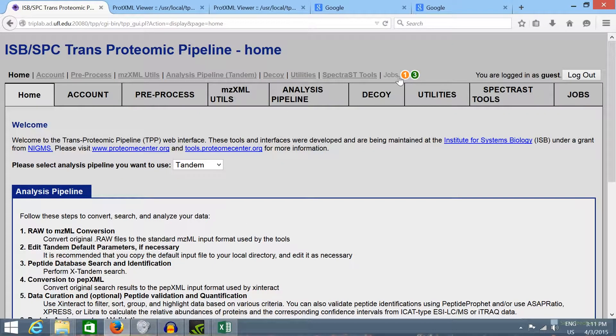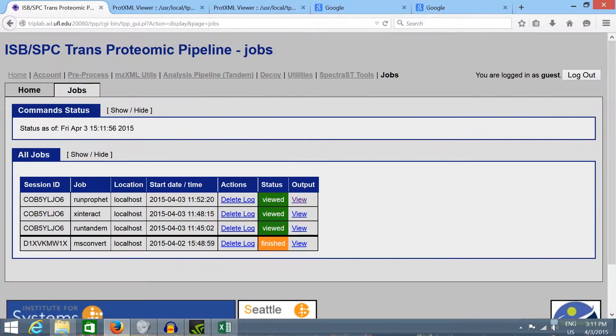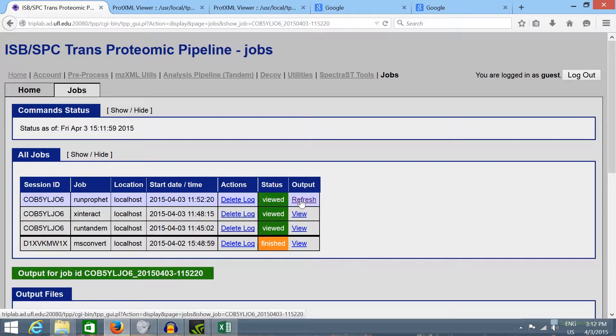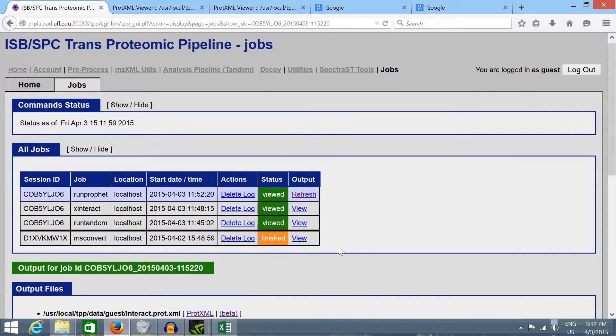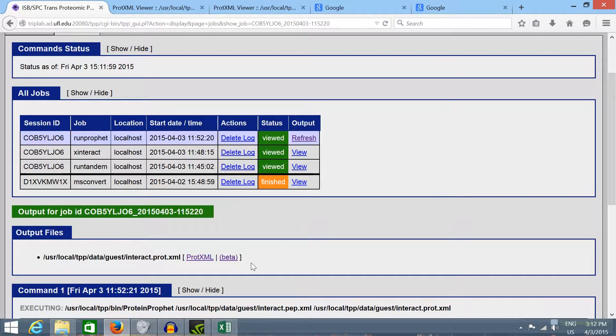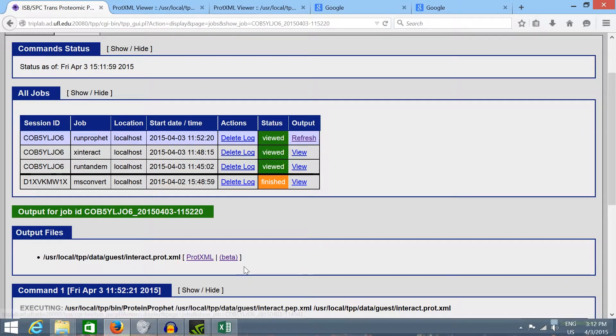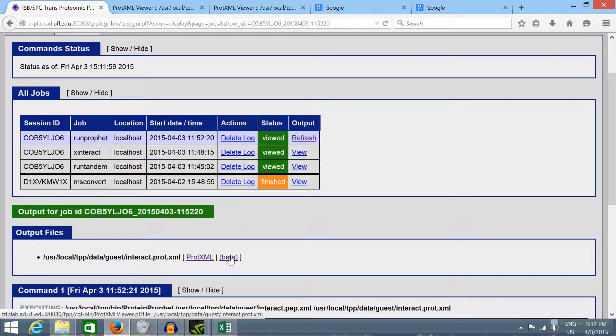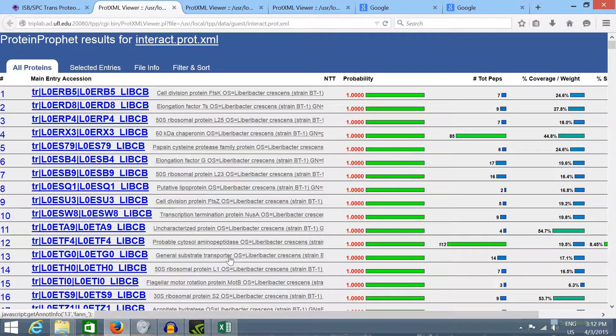In the jobs window of TPP I'll click here to view the result from the protein prophet that we have generated before and here I'll click in the beta link to visualize the results.